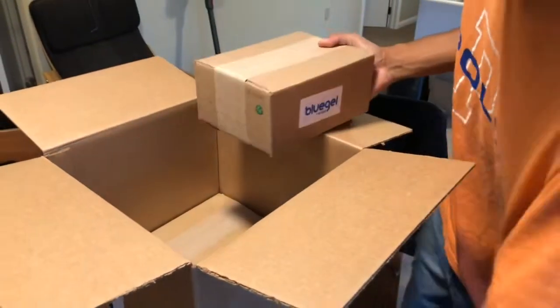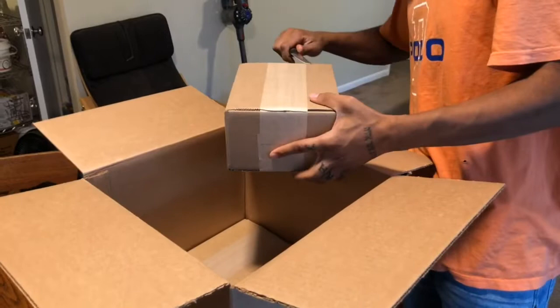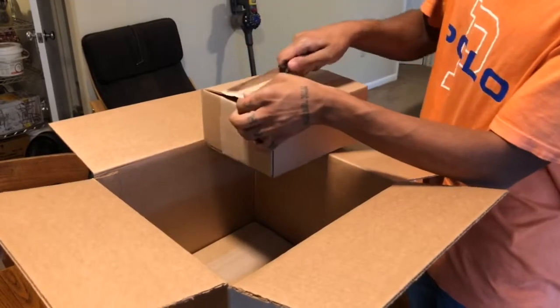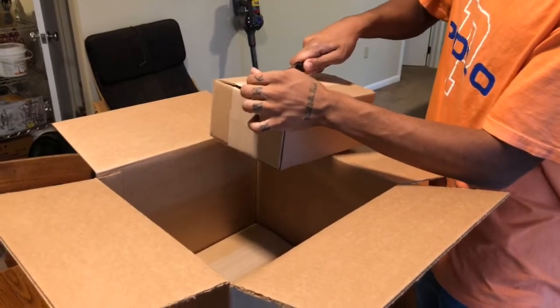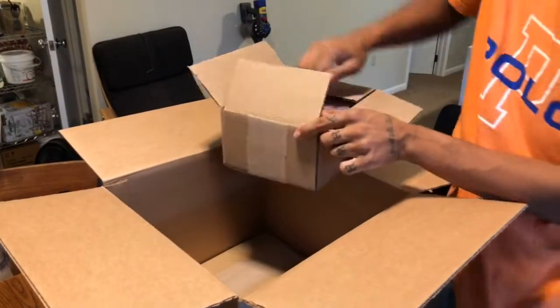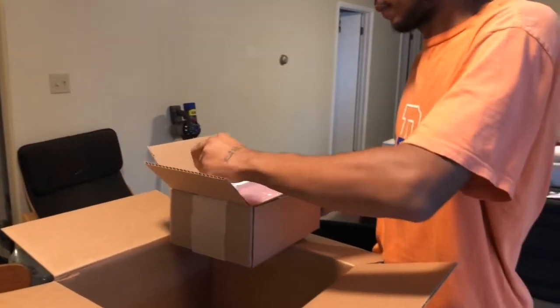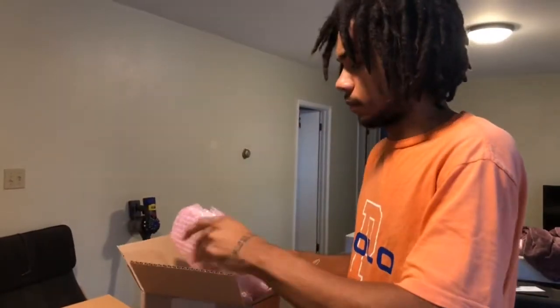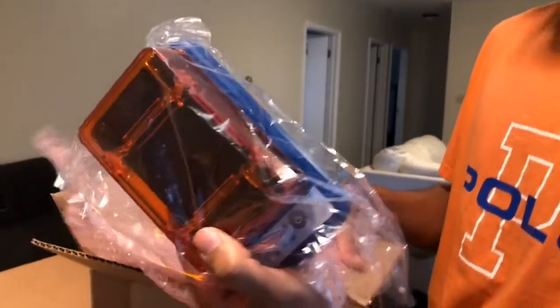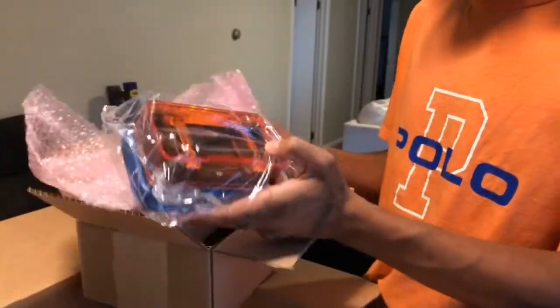Next up — we have our blue gel electrophoresis box. This is really cool because, unlike a lot of other gel electrophoresis boxes, you don't need an external power source. Plus it lights up from underneath, so you don't need another illuminator either.